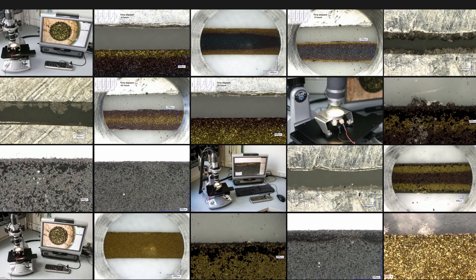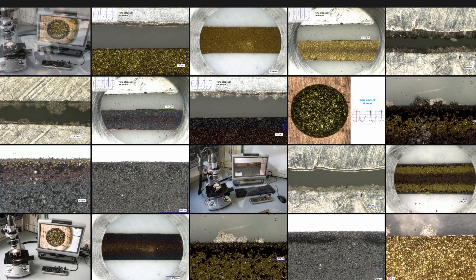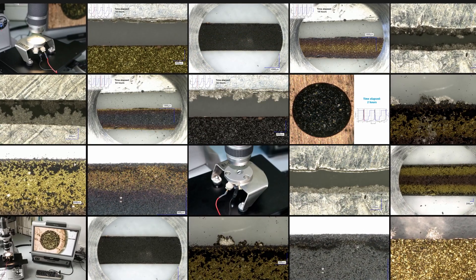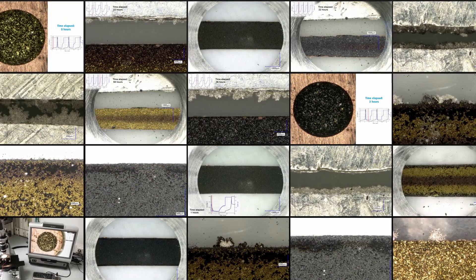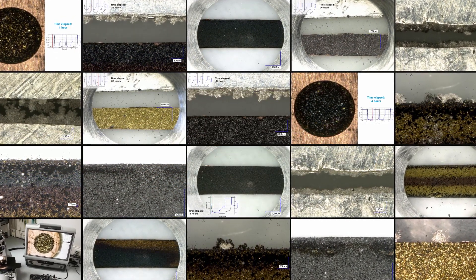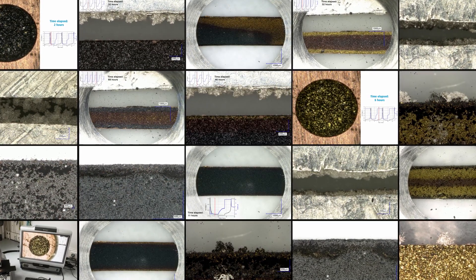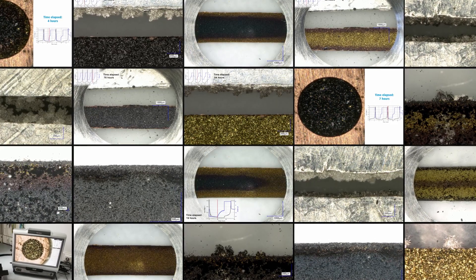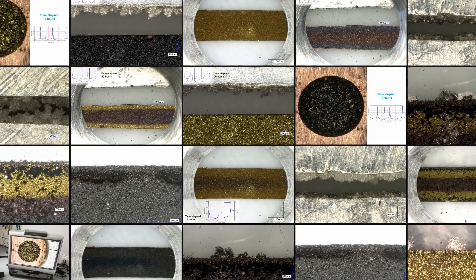Our optical battery test cells for in-situ microscopy open many new possibilities for the research of battery materials. With their help, scientists are able to directly visualize the processes inside a running battery. My name is Matthias Hahn and today I want to introduce our new generation of optical test cells.